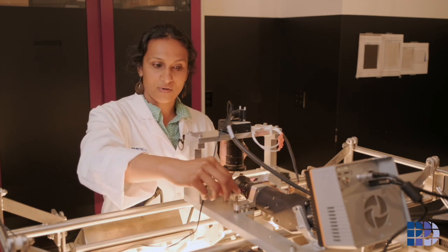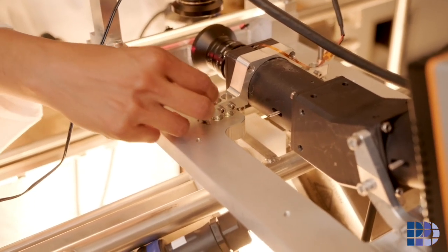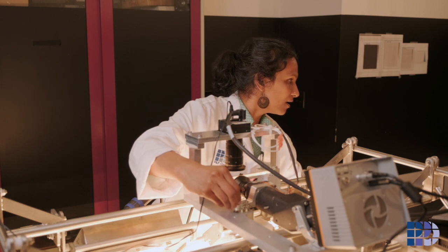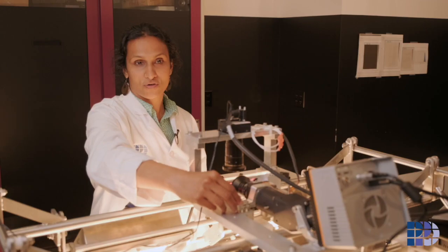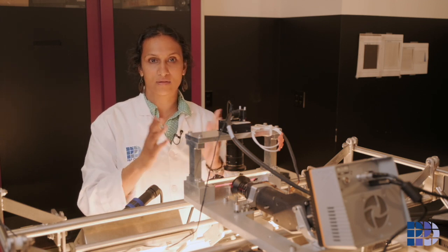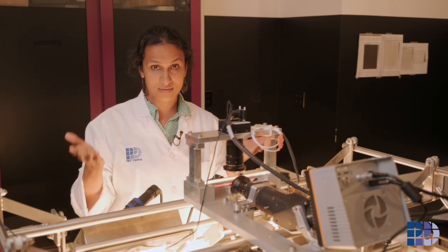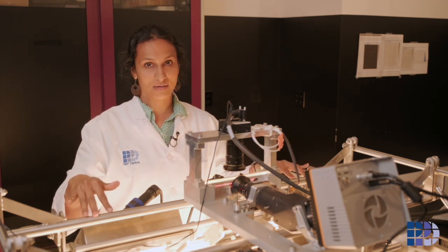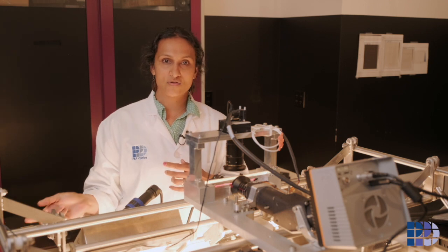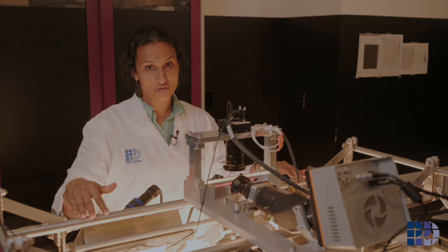And the spectrometer has some adjustment rings here. So I'm going to move that around until I see the dotted lines. So now that I have ensured that both the spectrometer and the visible camera are seeing the same scan line, which would mean they are going to see the object at the same time, the next step is going to be putting on the calibrated lamps. So Danielle is going to show us how the lamps are put together and how it's going to come back here and how we run our calibration.